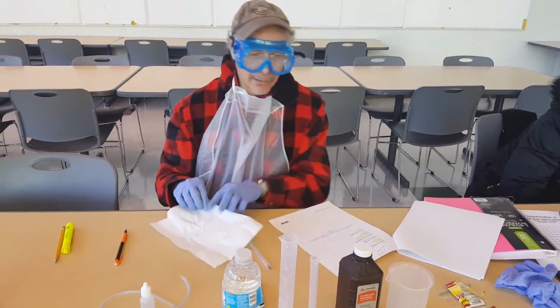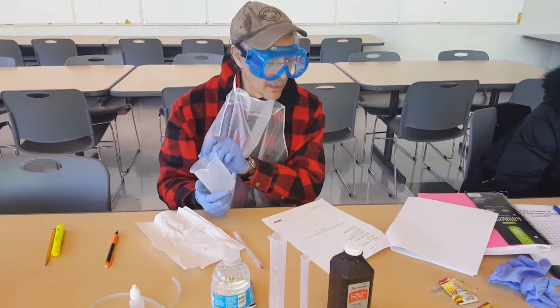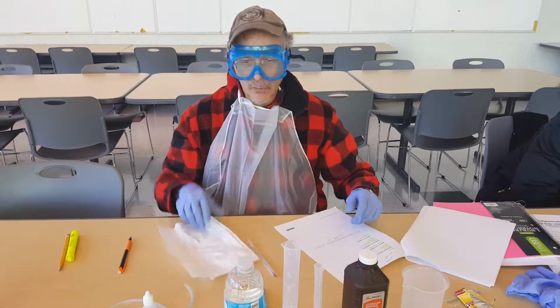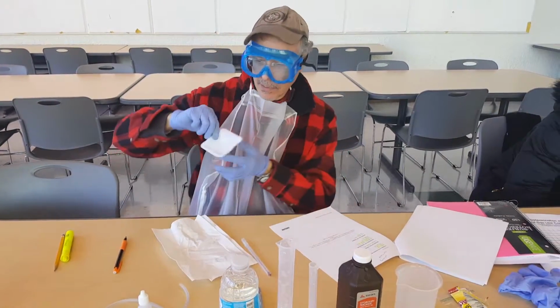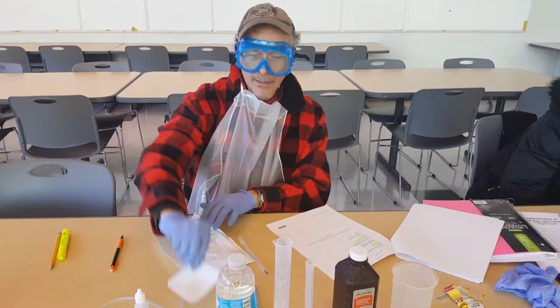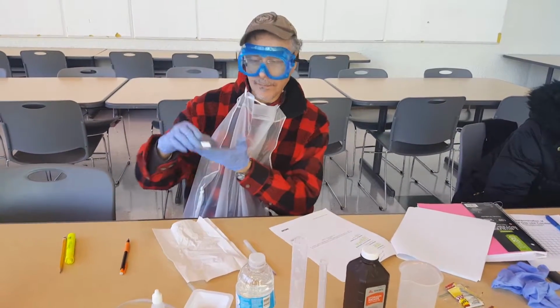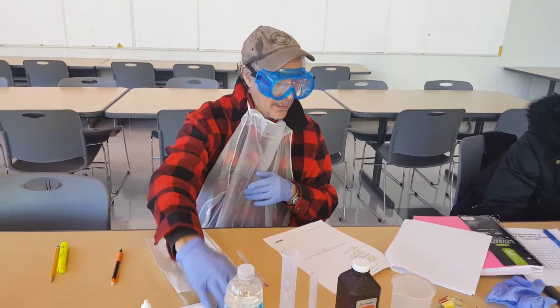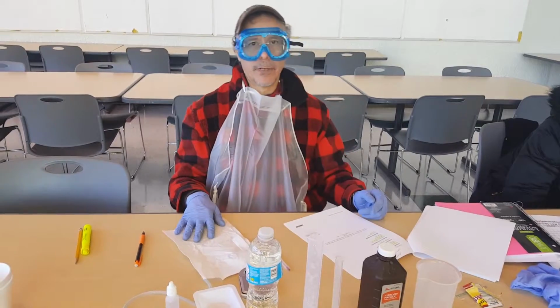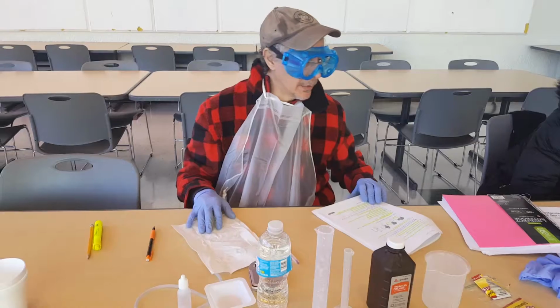And we also have a beaker, which is this right here. This is a 250 milliliter beaker, right? Okay. And we also have the weigh boat, which is this container right here. You can see it. All right. And then we also have the electronic weigher for the properties. And we also have the tap water right here, and we will have the graphing program here on software. So that covers all the material that we are needing.